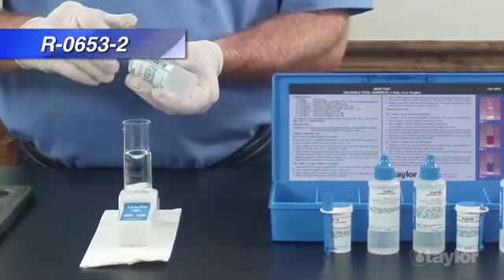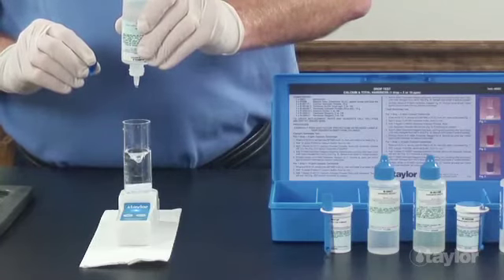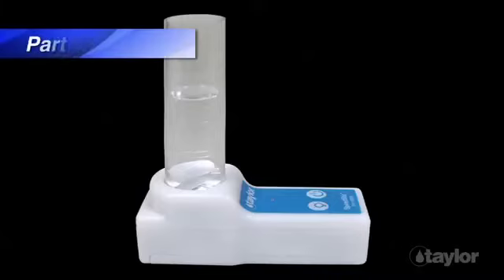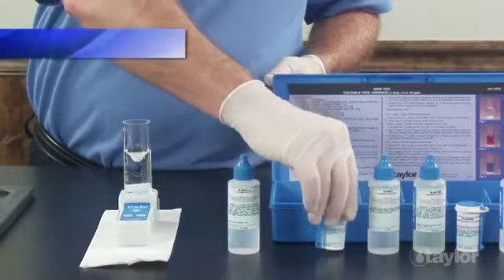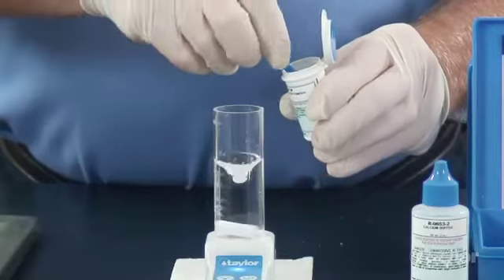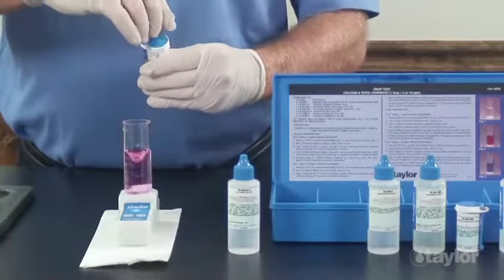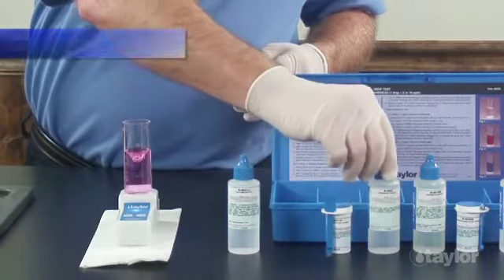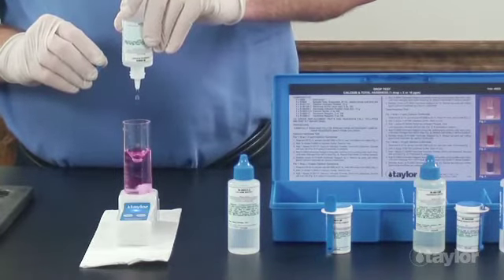Holding the bottle vertically, add 10 drops of calcium buffer and then swirl to mix. For this demonstration, we are using Taylor's Speedster, which is sold separately, but you can also manually swirl the sample. Add 1 level dipper of calcium indicator powder. Swirl to mix. The sample will turn red if calcium hardness is present. Next, add hardness reagent dropwise, swirling and counting after each drop until the color changes from red to blue.